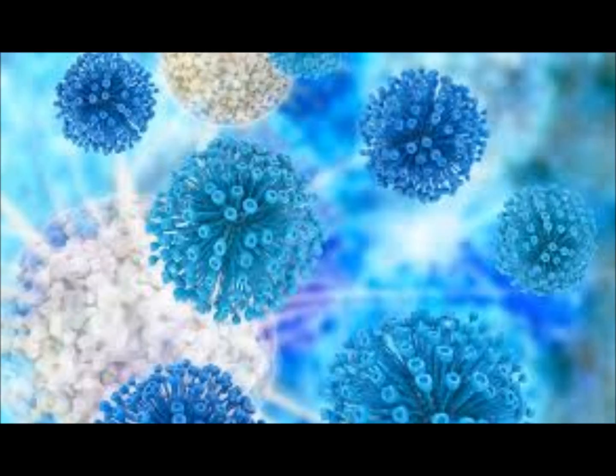We'll get into amount later, but usually this is few, moderate, many, depending on what quadrant, or it'll be light growth, moderate growth, heavy. If it gets all the way to the third growth, that's either heavy growth or, depending on how your lab calls it, 3+, 4+. But remember, it's all about your technique.